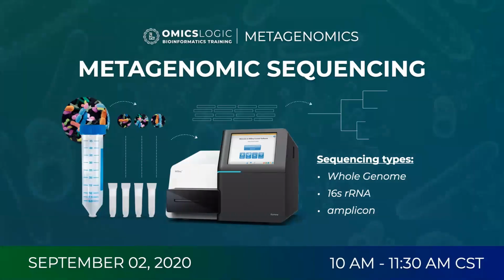So last time we talked about metagenomic sequencing, how we can run a sequencer to understand what do we have in our collected sample. And there's a few steps that you kind of go through before that data is prepared. And that method of preparation is going to define how you analyze. So some things are just not going to work. Some questions are not possible to answer with specific data sets. But there are some ways around it that we can also discuss today in the context of today's session.